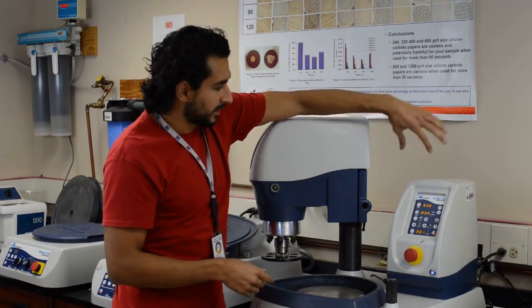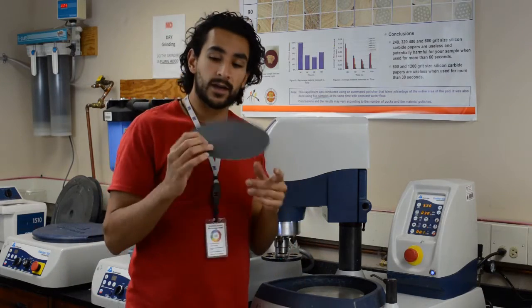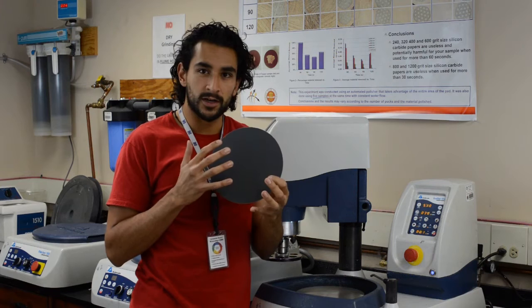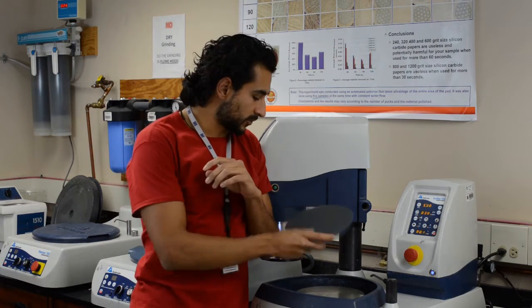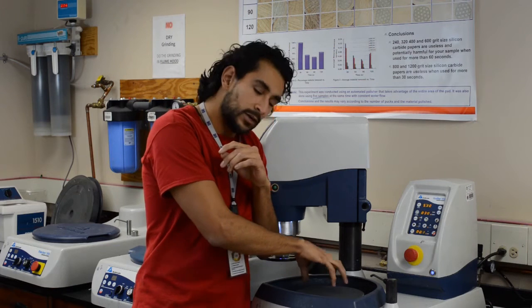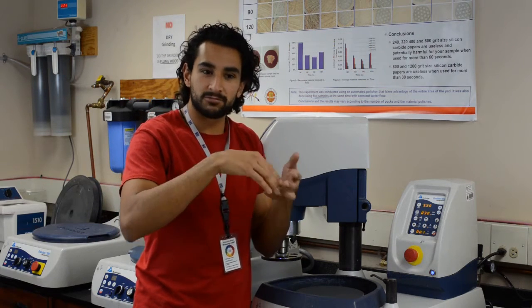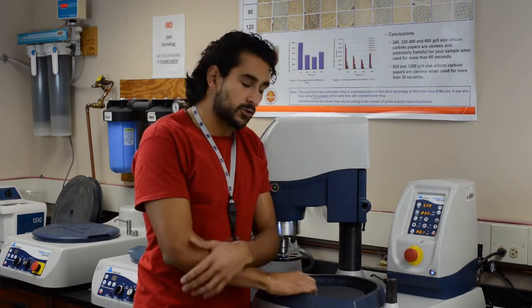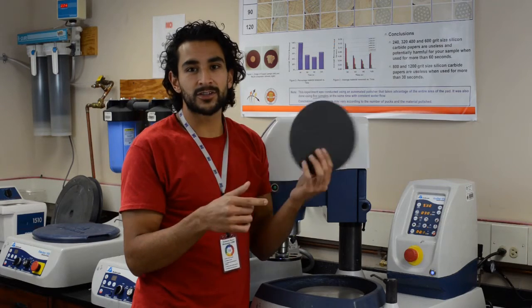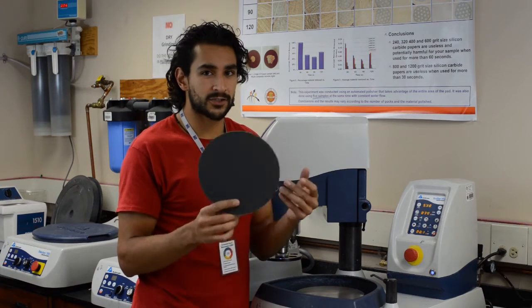You turn it on and it has several buttons to dial in your settings. This is very important: the silicon carbide sandpaper particles don't stay very long. It's very important that you don't use them for longer than a minute. Once you stick this on, start running with water, and your sample starts pushing onto the surface, all the silicon carbide particles start tumbling and get lost in the water. After a minute, there are almost no silicon carbide particles left. So don't waste your time — use them for a minute and then toss them out. They're about a dollar a pop, so use them efficiently.